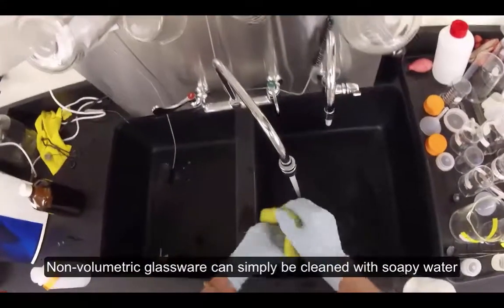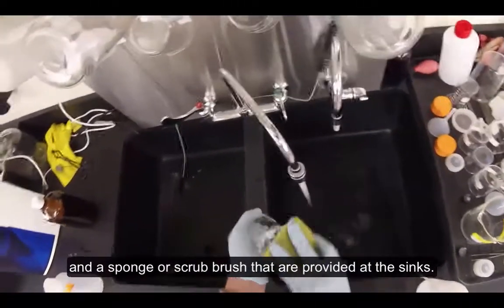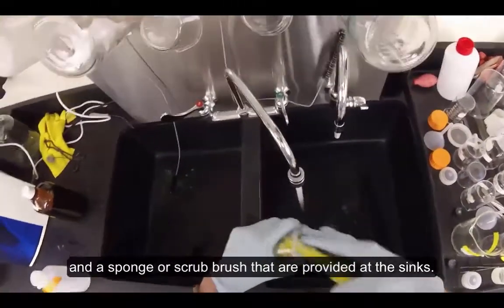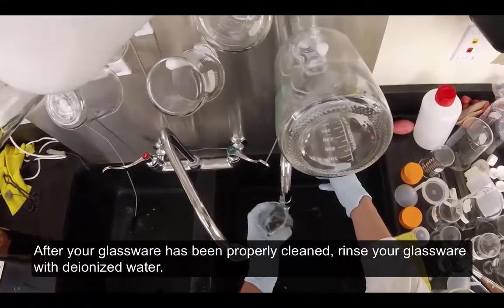Non-volumetric glassware can simply be cleaned with soapy water and a sponge or scrub brush that are provided at the sinks. After your glassware has been properly cleaned, rinse your glassware with deionized water.